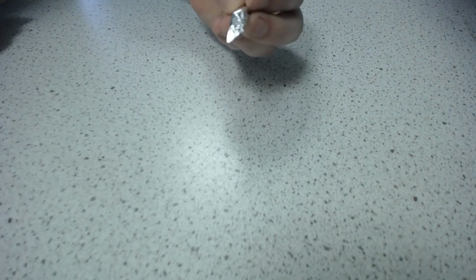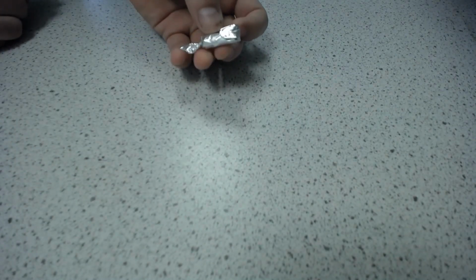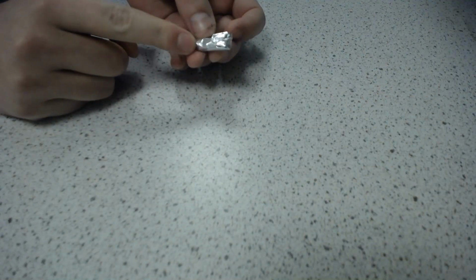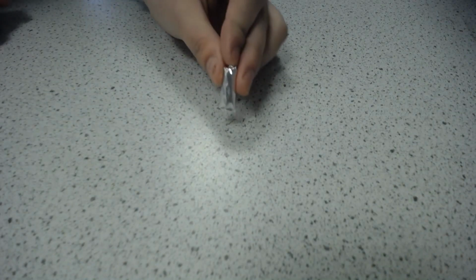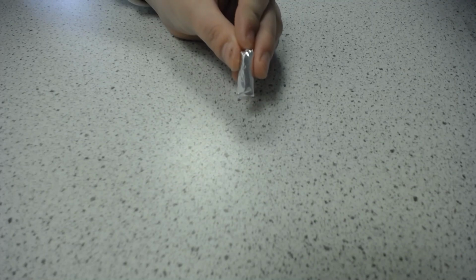Now you can either twist the ends like a sweet, if you like that, or you can fold over onto the suppository, like so. I prefer folding it onto the suppository as opposed to the sweetie wrapper technique, so that you get left with a small silver tube looking thing like so.